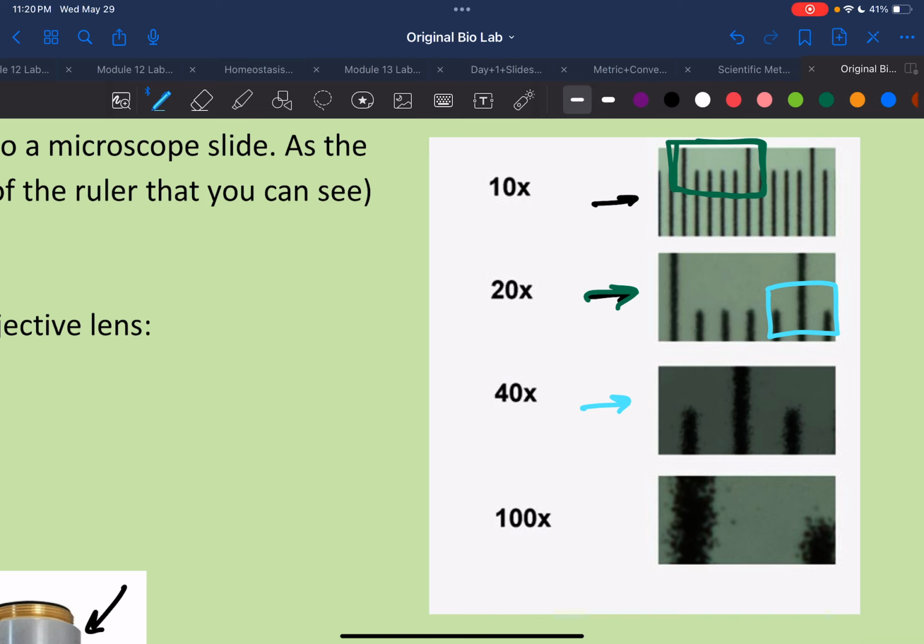And then I zoomed in again, and all I can get is, I don't know, like this little piece right here. So then I get this image right here. So hopefully that makes sense. I know this is really difficult in an online environment because we are not looking at things, we're looking at images. So I'm zooming in every single time, and I'm staying in one spot, right? So I will lose some of the bigger picture.